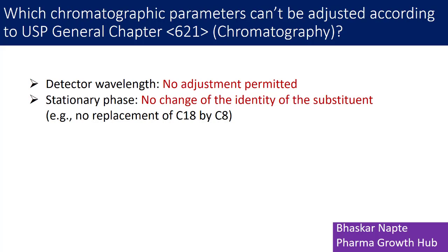The reason this chapter does not allow a change in stationary phase is that such a change can bring a change in the order of elution, change in retention time, and change in selectivity — which is a very significant change. This may mislead you into wrongly identifying a compound. Your relative retention time and relative response factor can get changed, which can further lead to errors during quantification. For that reason, the stationary phase cannot be changed.